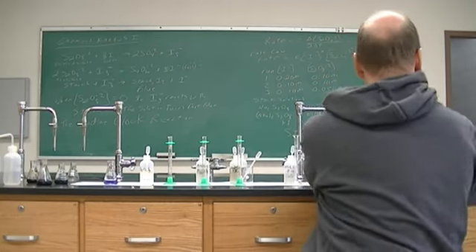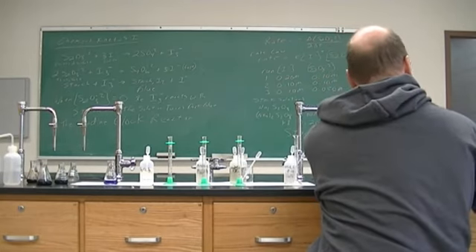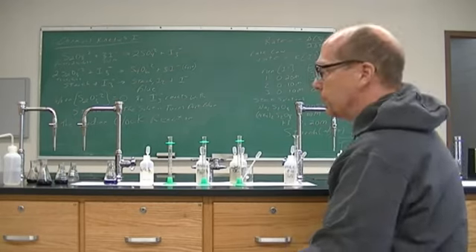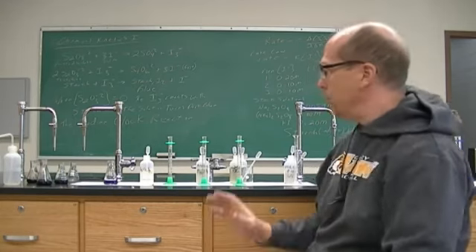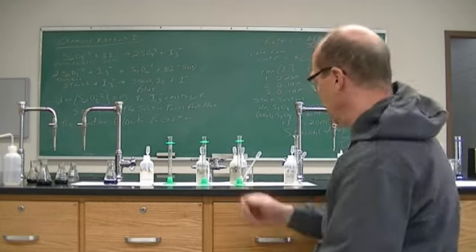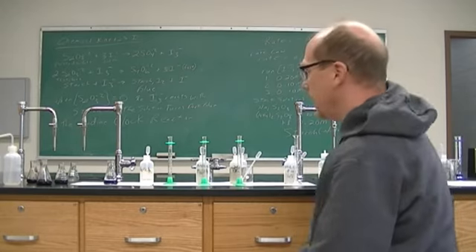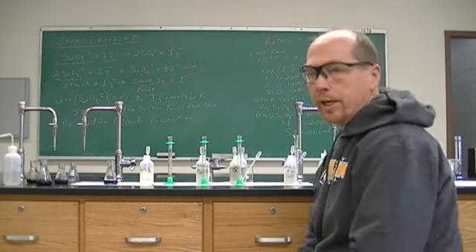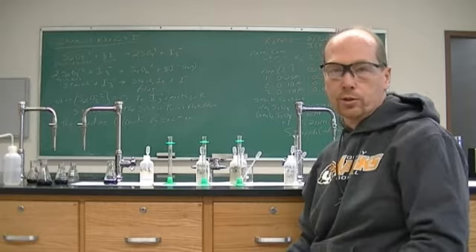And that is 25 seconds. So 2 seconds, 30 seconds, 25 seconds. So for the catalyst, it was just to show that these reactions are much faster when you add a catalyst to the reaction mixture. And so that is it for our data sheet. We will go through the calculations next.